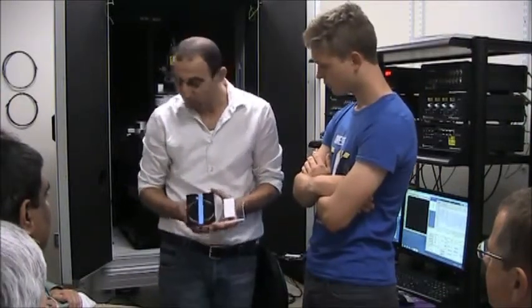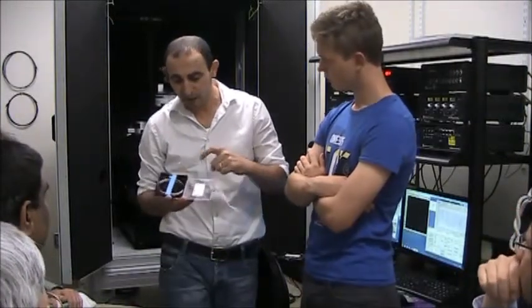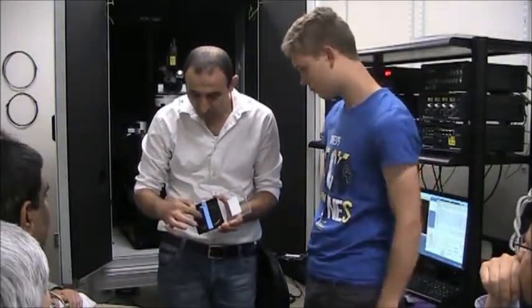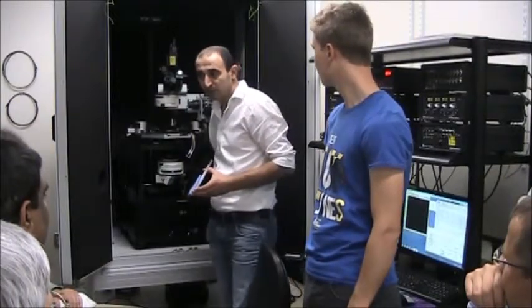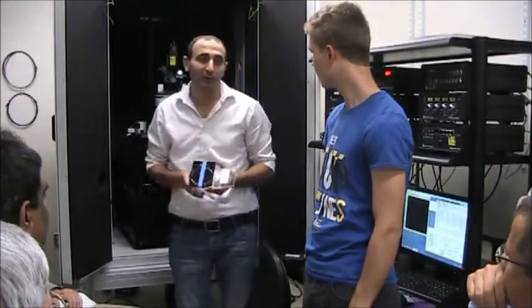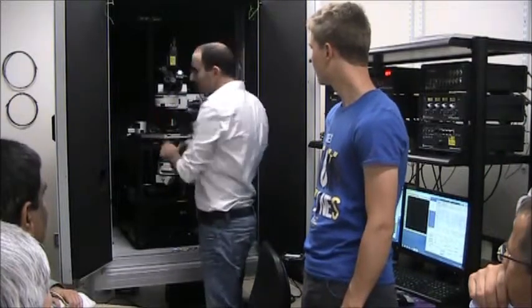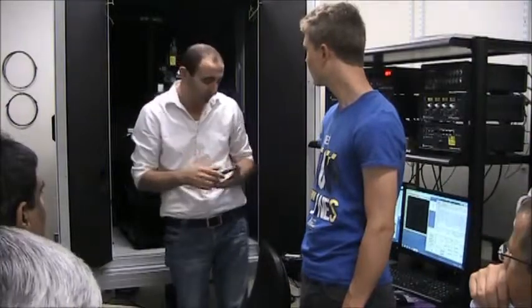A similar AFM probe will be mounted on the second tower, the second AFM system. The second probe will come close to the first one, collect the near field light, and couple it through the fiber. The fiber is connected to a detector, which could be a PMT or an APD detector. Okay? So this will be near field injection of light and near field collection with two NSOM fiber probes, where you can easily use two piezo stages, two independent AFM systems, to bring them close enough to each other and do this task.